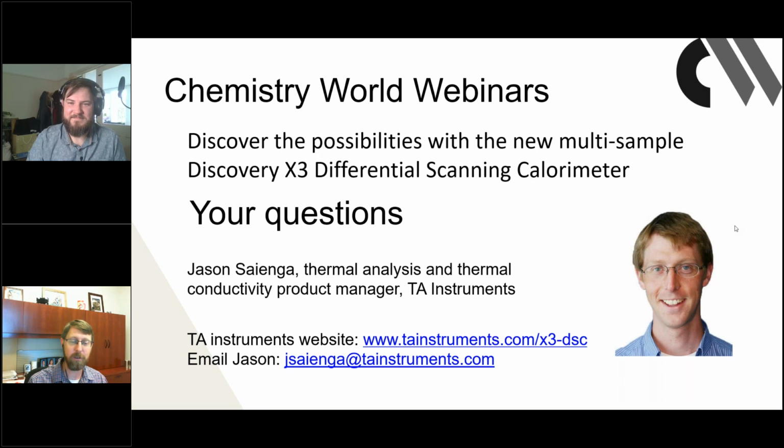The DSC itself doesn't really have any vibration control, and so you have to be somewhat cautious where the DSC is placed. Some of our other instruments that have more critical need for vibration control, we have suggested a marble table of some kind to isolate the instrument from outside impacts.